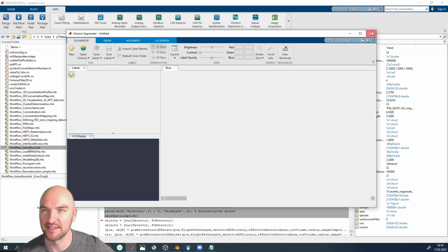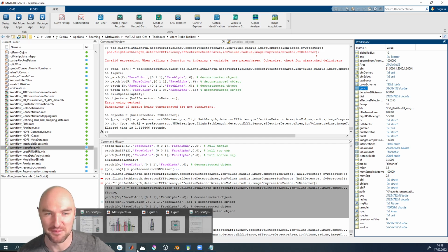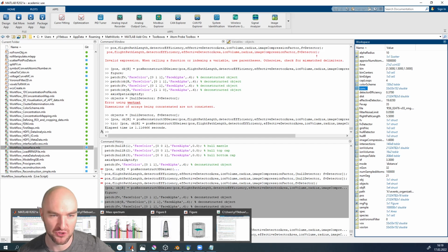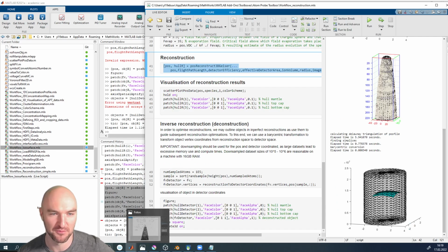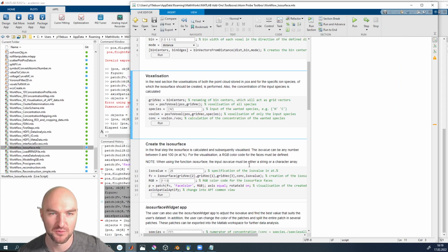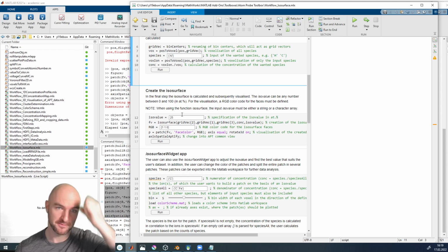Okay, so whatever that thing does, it does not create isosurfaces. Doesn't matter all that much anyway. So the next thing I'm going to do is try and get a good estimate of what a reasonable ISO value would be. Do we have that in here? Now here we already jump in with the ISO value.